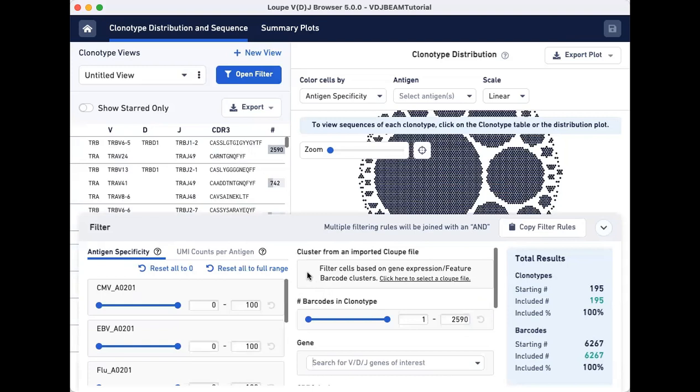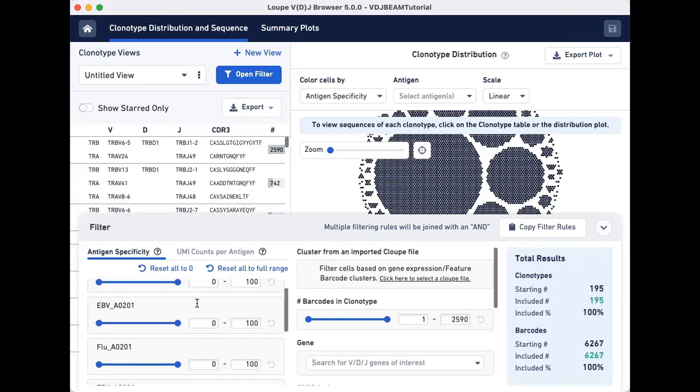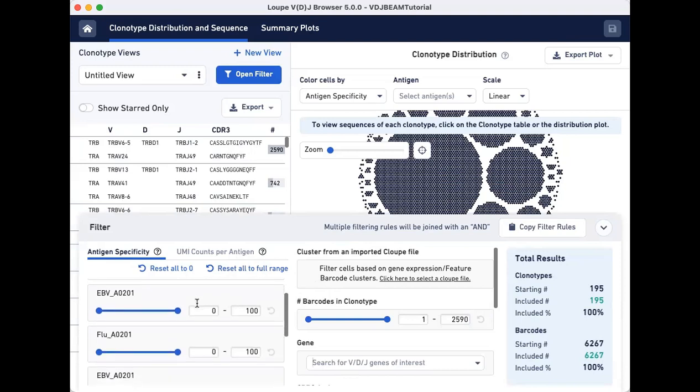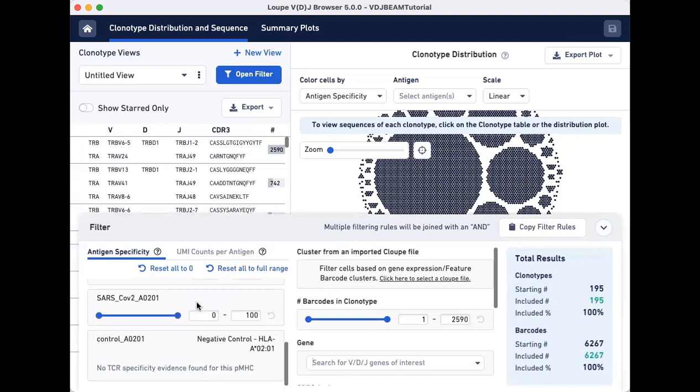This panel allows you to filter by antigen specificity scores and by UMI counts per antigen. All antigens provided in the feature reference CSV that was used to run cell ranger are listed here.